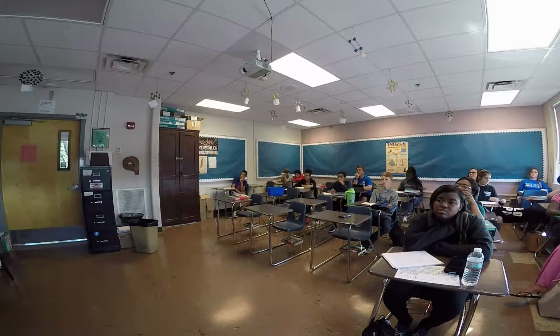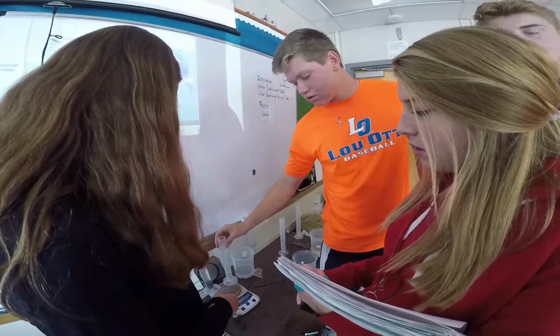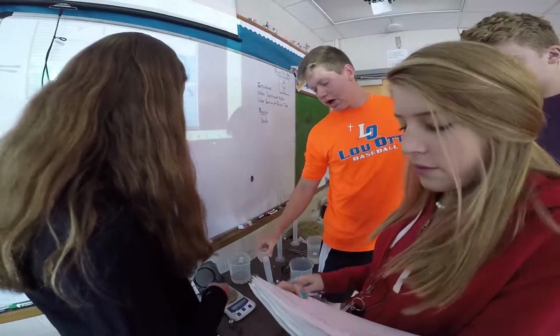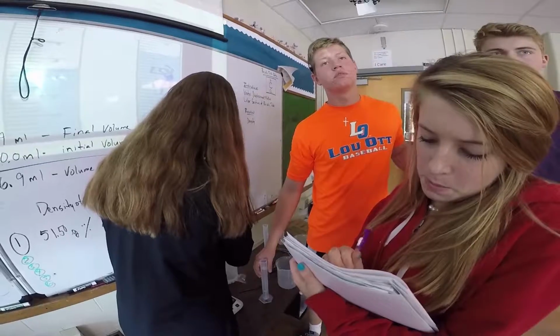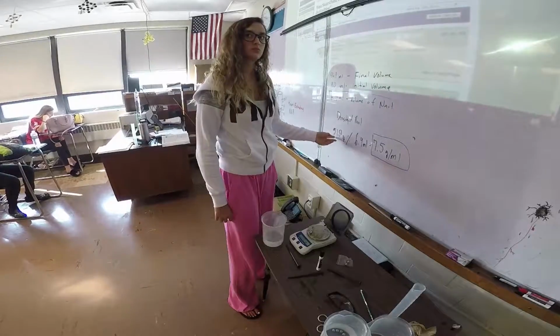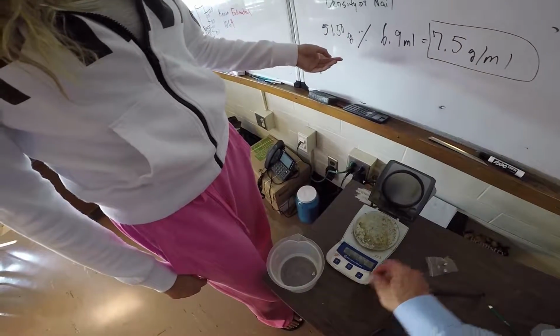So what we're going to do today, we have a little lab over here. You're going to take it out and weigh it separately, and add it up? Right. That's the mass of the ball bearing, right? 7.13. So that's the mass of this.